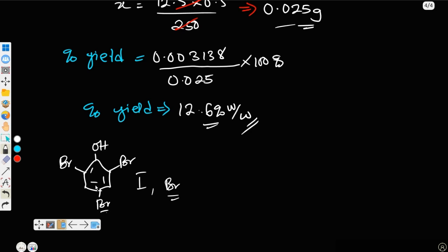So that is that. Iodine partitions into the chloroform layer and imparts visible color. It is necessary to shake well, since the thiosulfate will react only in the aqueous layer. Iodine and bromine will partition into the chloroform layer. So it's more like solvent-solvent extraction and not even precipitation. You add the chloroform so that in case there is any iodine, it will go to the chloroform layer.